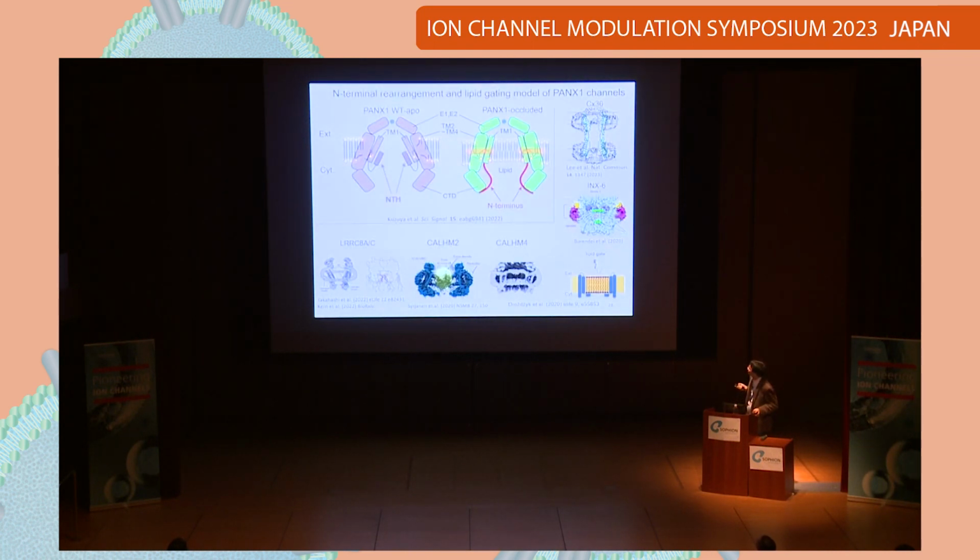So in this study, we found two conformations of the pannexin 1 channels in a lipid nanodisc. One is wild-type apo, showing the wide pore surrounded by an N-terminal funnel. And the other one is the pannexin 1 occluded form. Here, the N-terminal portion is oriented to the cytoplasmic side, and there are pore-occluding densities.